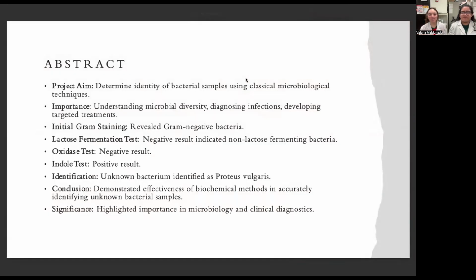We are presenting a project based on identifying a bacteria. We used microbiological techniques, and this is important because it helped us understand microbiological diversity, and also figure out how to diagnose infections and target certain treatments, as we learned further throughout the class.